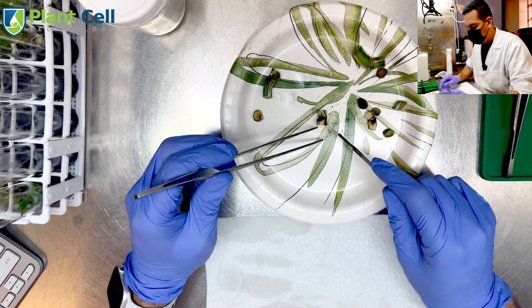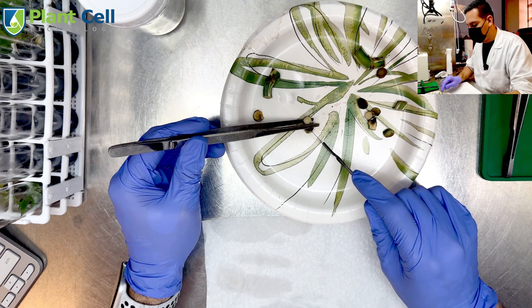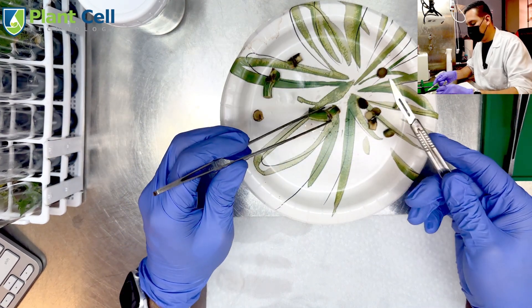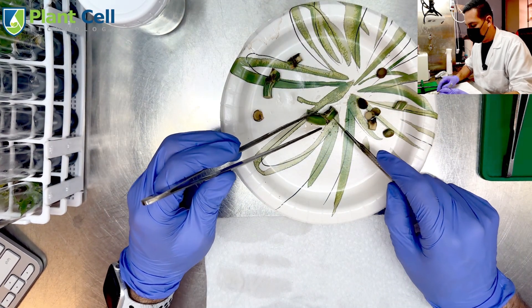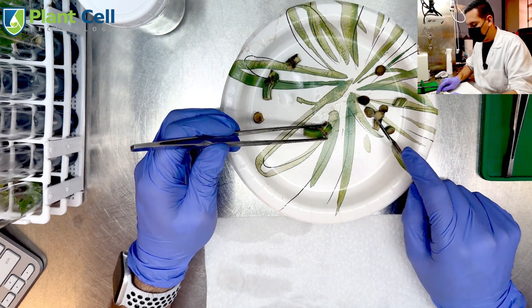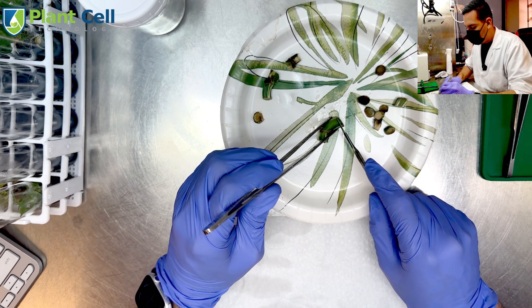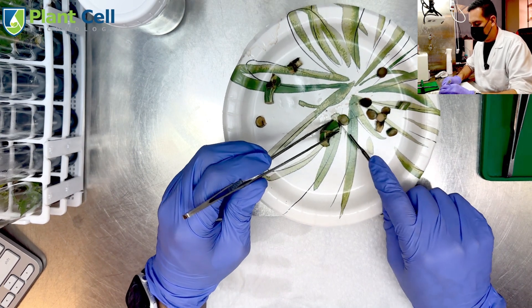If you don't know what phenols are, basically it's like plant blood. That's the reaction that the plants get from cutting, so you want to prevent that in your tissue culture media.